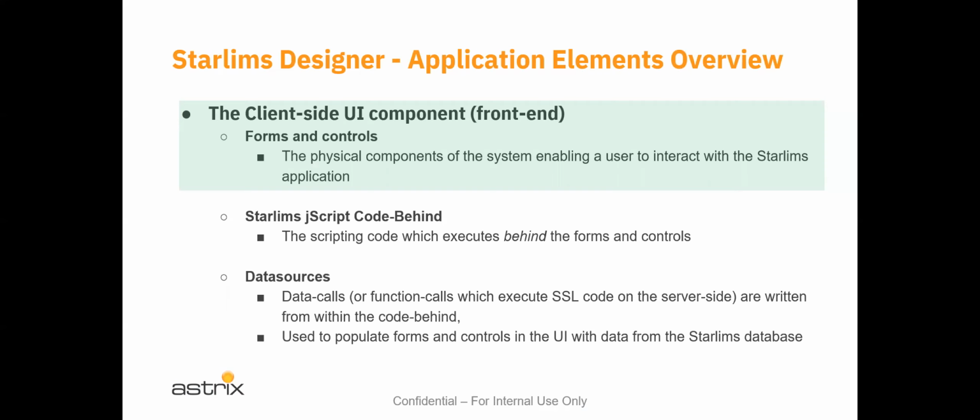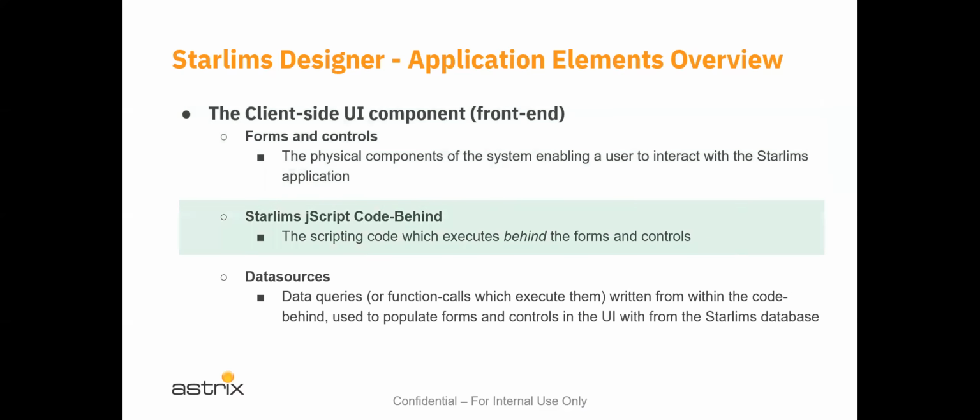Data sources, that's how we affectionately call the code blocks that perform the data calls from STARLIMS clients and the server script to the server database. And we send data, we send requests, we get requests, we can send inserts, selects, anything that relates to a SQL statement. We do that from the data source control.